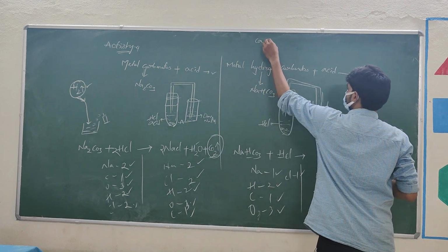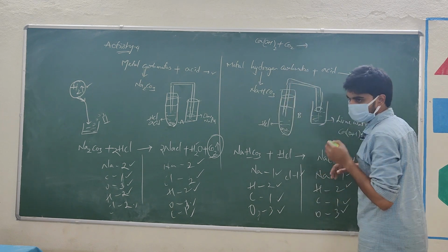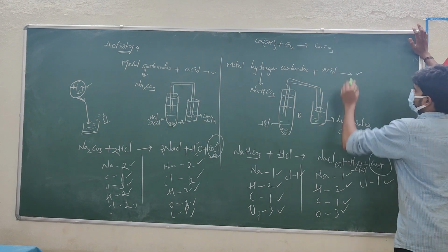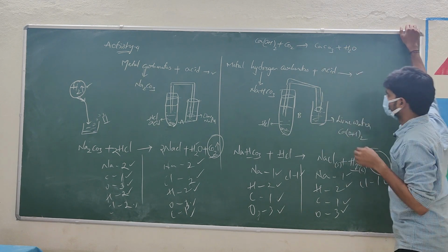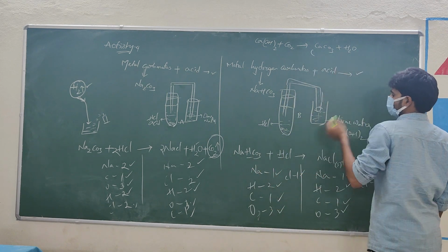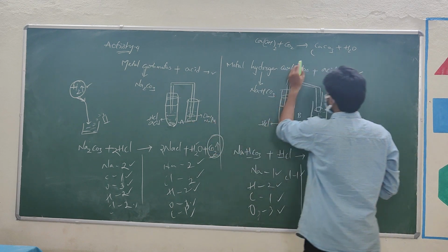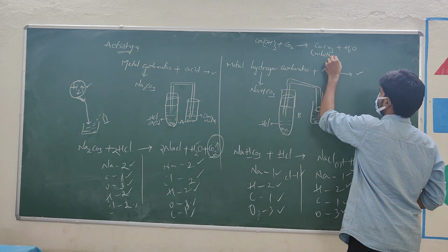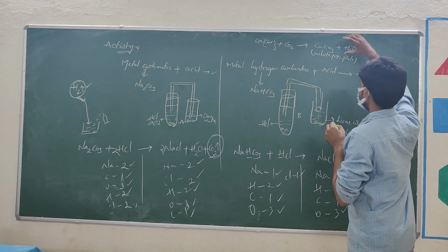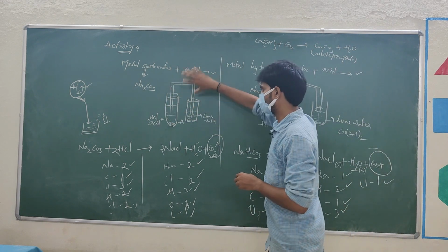Now when calcium hydroxide is added to carbon dioxide, we get a very special thing, that is CaCO3, calcium carbonate, and some amount of water gets evolved, right? CaCO3 is nothing but calcium carbonate. Now in this case some deposition happens here, that is a white precipitate formed, white precipitate, okay. Now after this happens, the carbon dioxide is still coming out, right? So the process goes on.